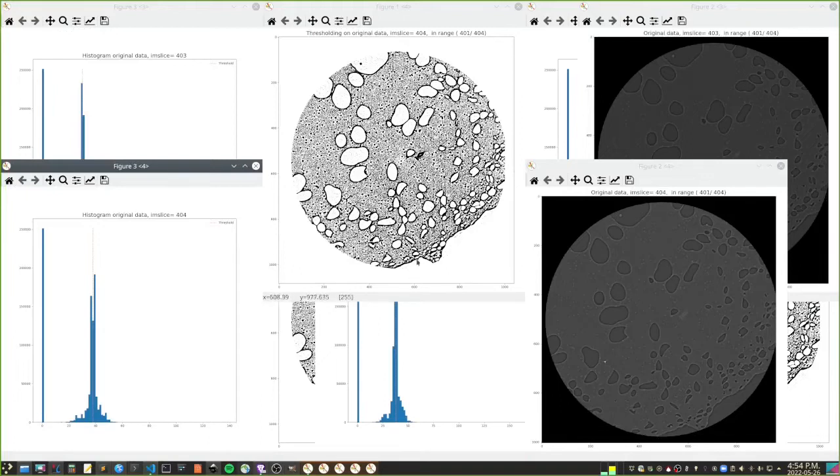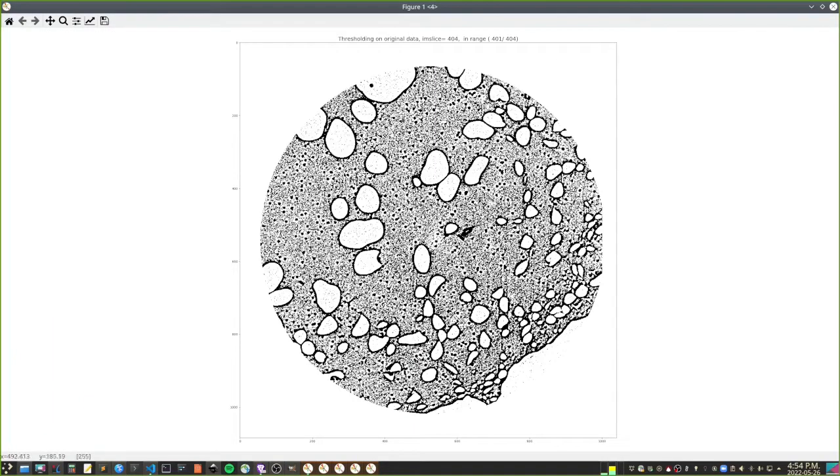Okay, this is probably going to work because you see the part outside is white. The next step is the Canny edge detection. From this thresholded image, it's going to find the strong edges, and then it's going to enclose it, find a closed contour, and the outside of that will be the perimeter. So what will probably happen is that these big bubbles will also be considered outside.